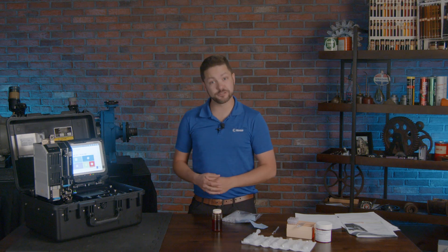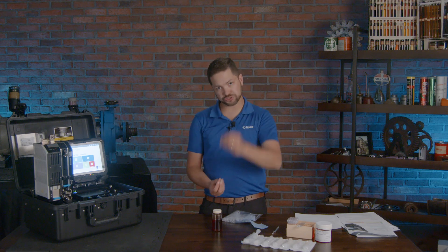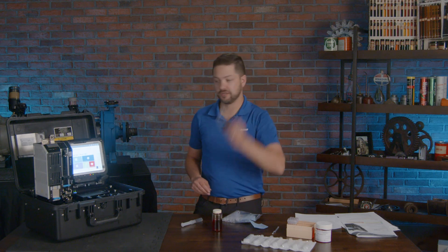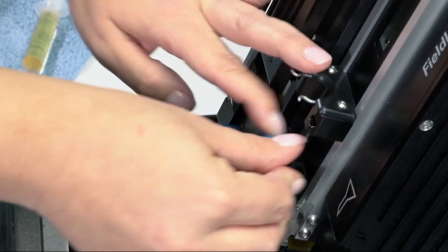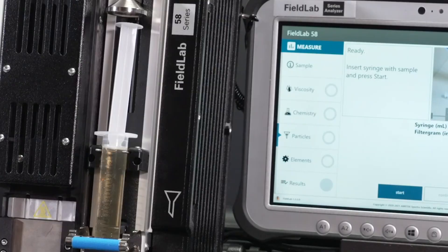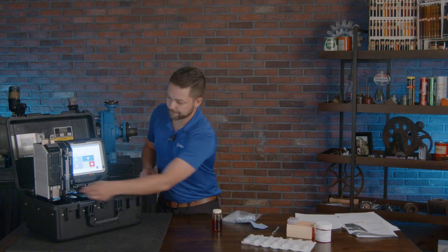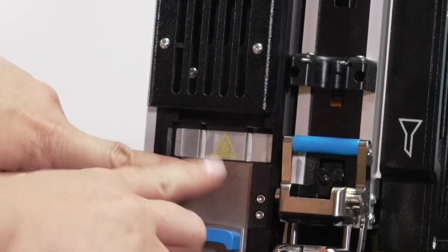Over here is the XRF, and it works by preparing a filtergram — basically a filter patch that collects debris as you push oil through it. You collect oil with a syringe, push it through the filtergram, place that at the bottom, push it down, and let it run the test. It's going to push the oil through, prepare that patch, and then you take it out and place it in the XRF module on this side, which collects all the data related to 16 different elements.